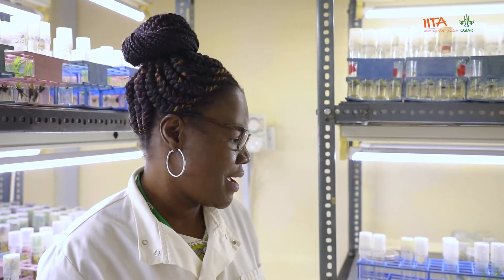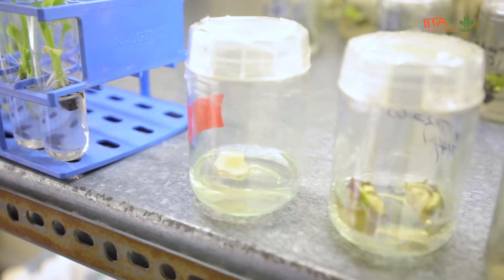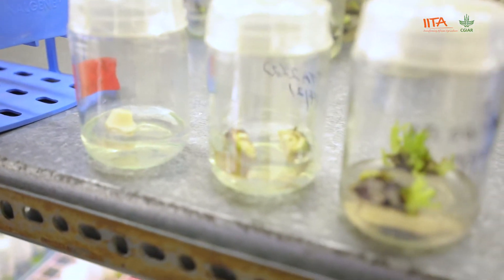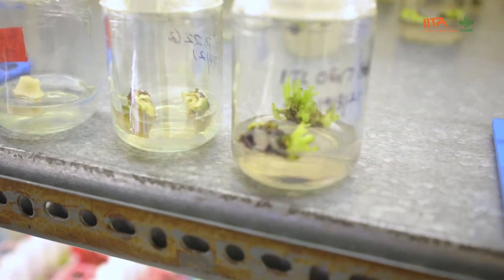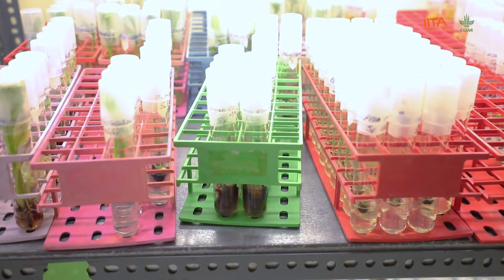In this lab we also multiply plants to get large numbers. We take a single sucker from the field, remove the heart or inner portion, and put it in tissue culture. After about six months we can get up to one thousand plants. You can see that we increase the multiplication rate significantly using these techniques. These are the various stages you go through until you get a rooted plant that can go out in the field.